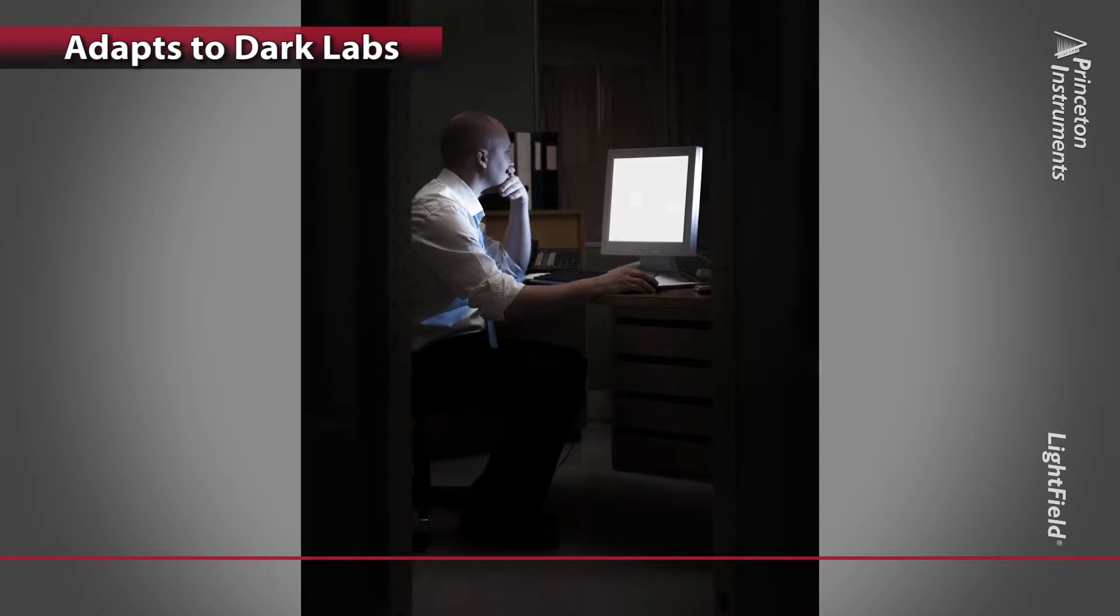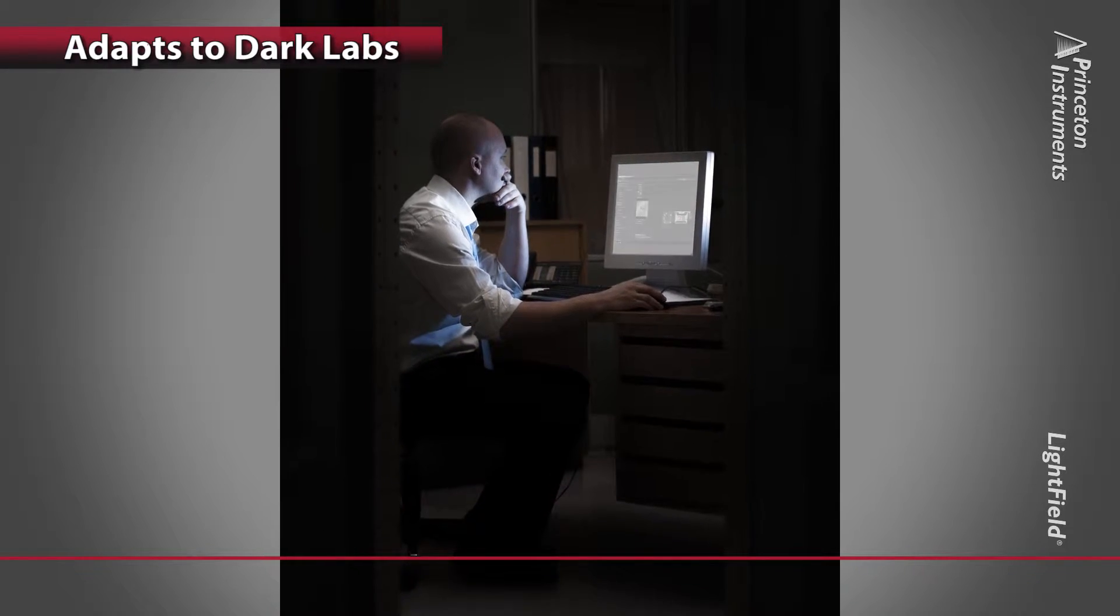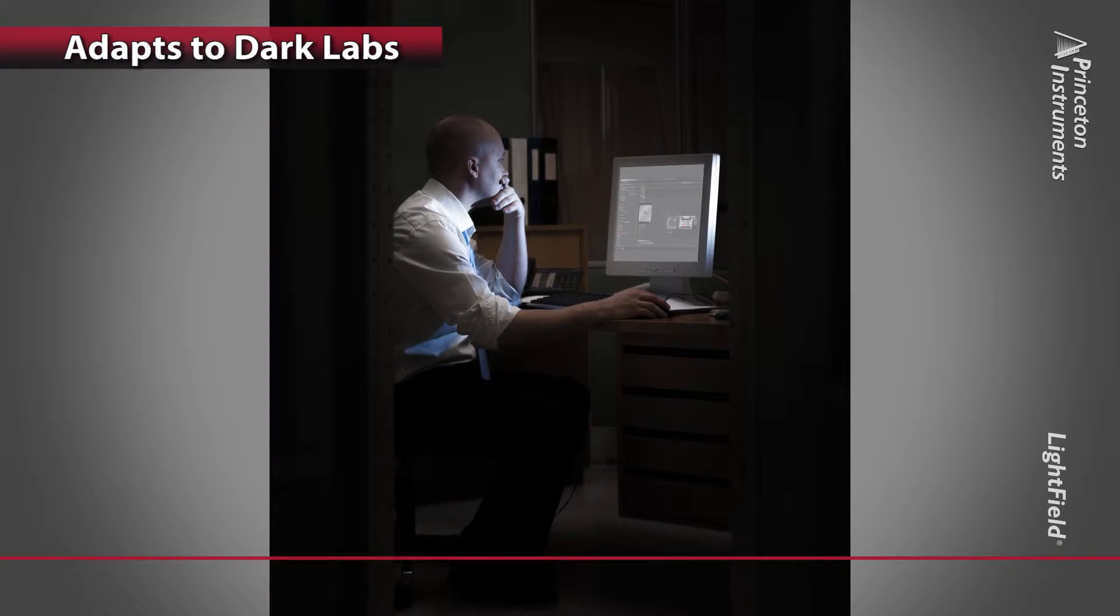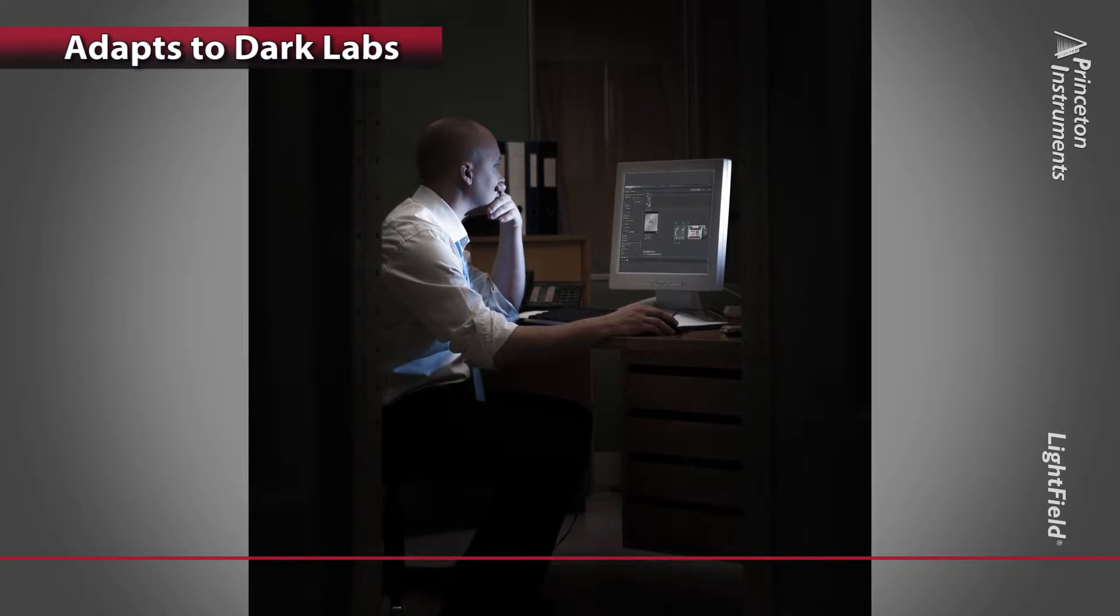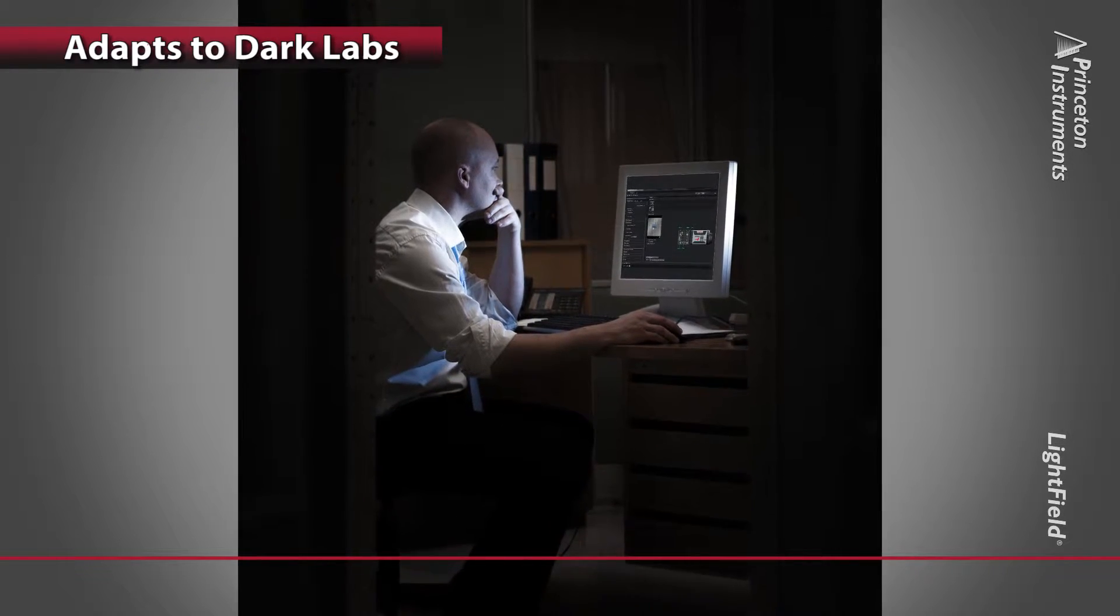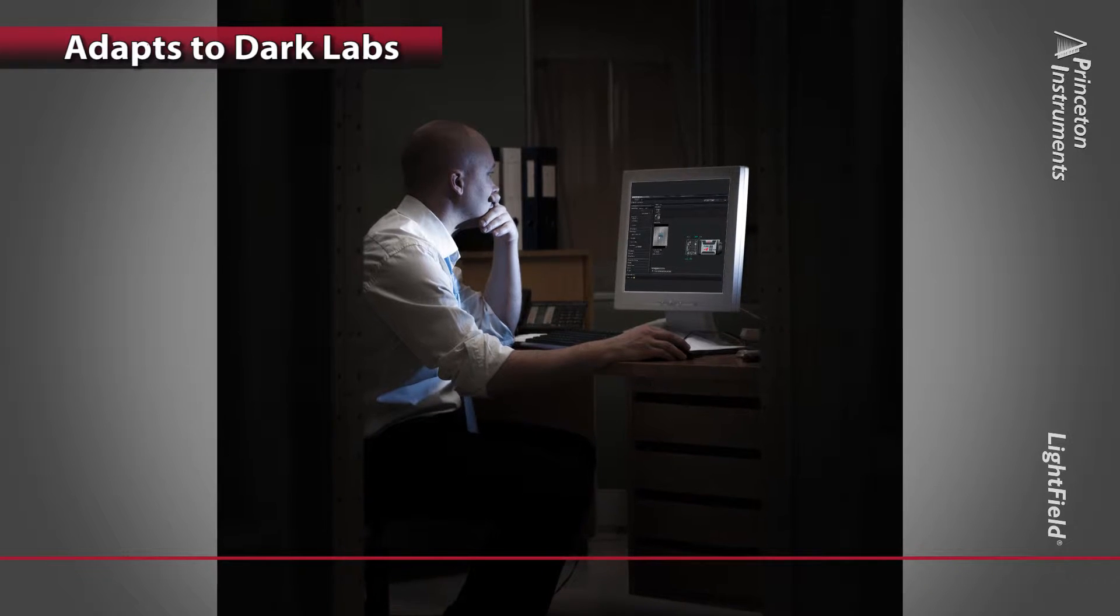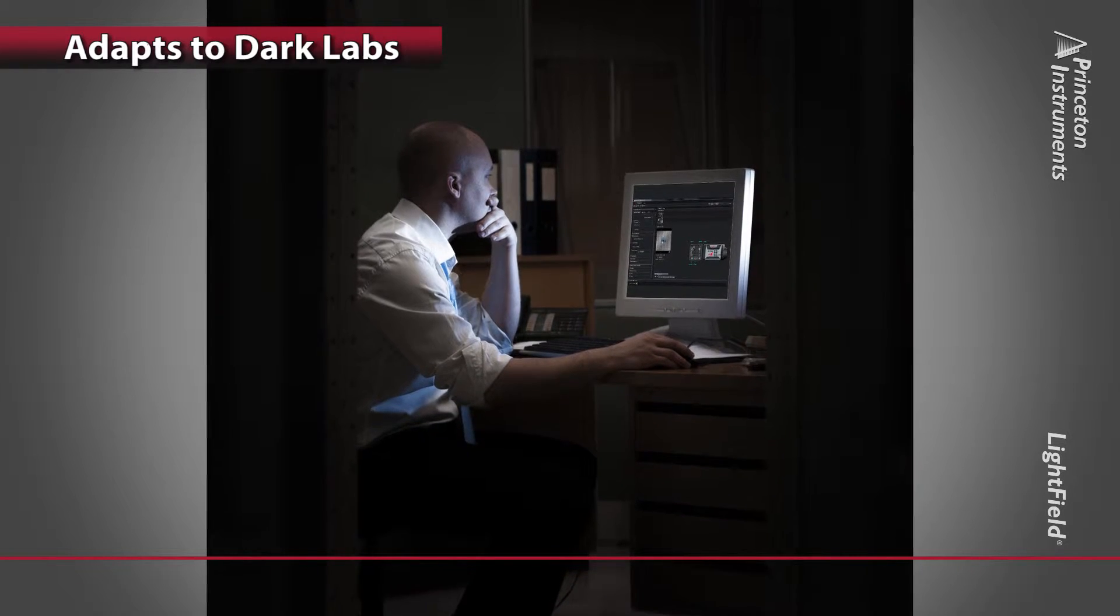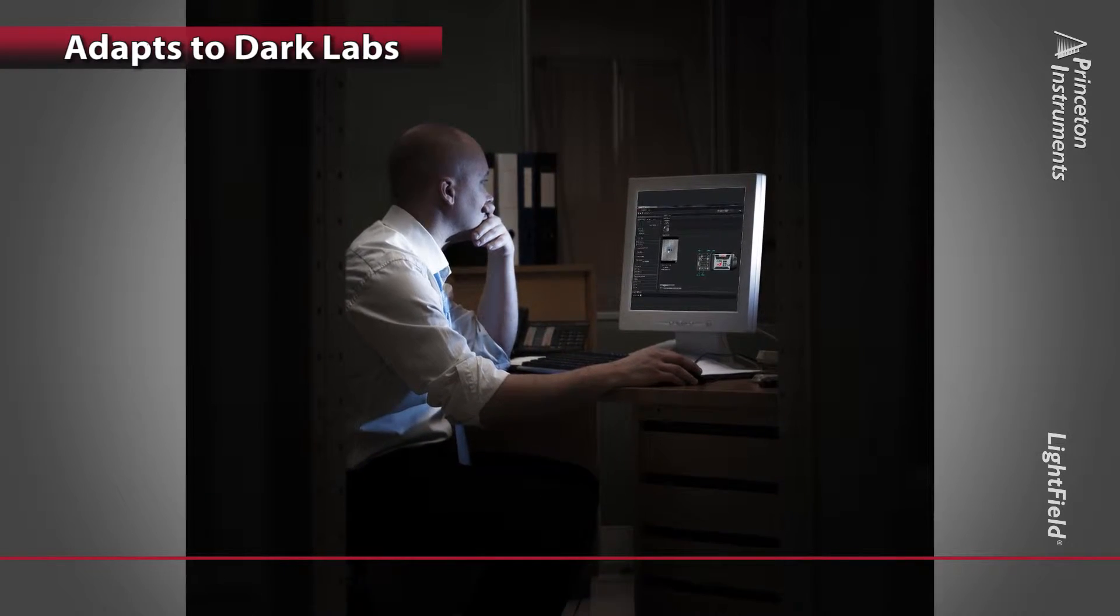Because very low light levels need to be detected, most labs require a dark environment to minimize light pollution. Lightfield's dark gray background reduces light scatter and minimizes eye strain.